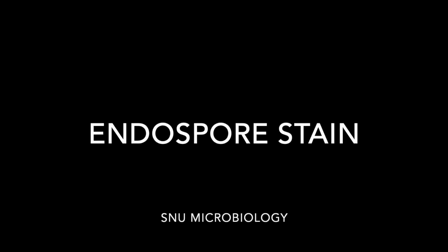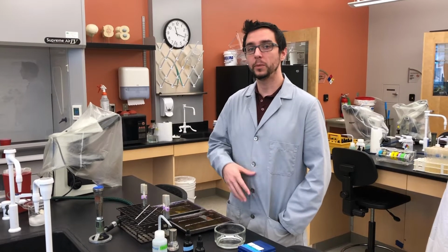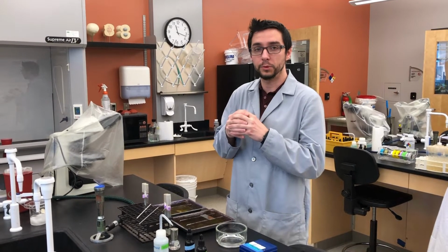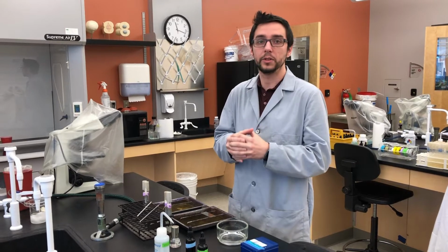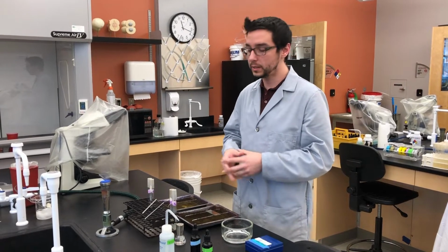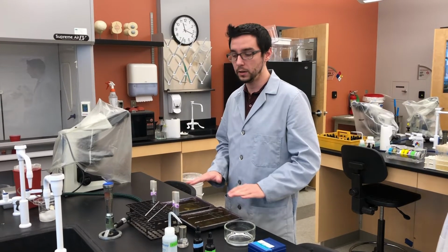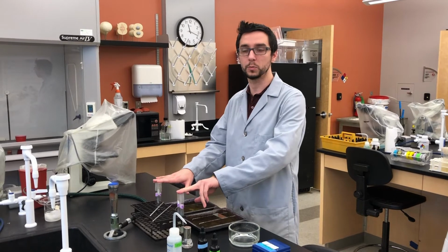Howdy folks, and welcome to this microbiology video where we're going to be talking about how to do an endospore stain. Now if you remember back from lecture, an endospore is when a bacteria pulls itself together in an instance of drought when nutrients are scarce so that it can try to survive until the next time nutrients are once again available. Not all bacterial species are able to form endospores, so what this test does is reveal with a differential stain which bacterial species is actually able to form an endospore.